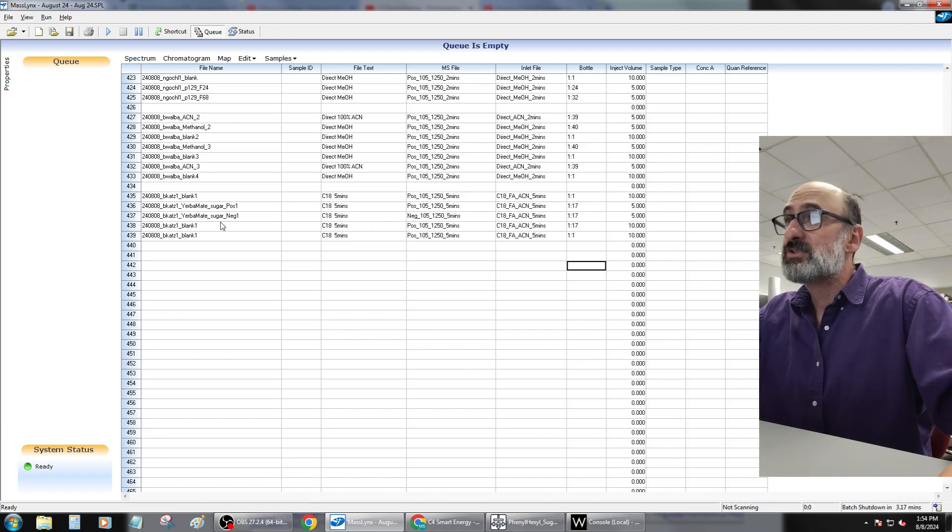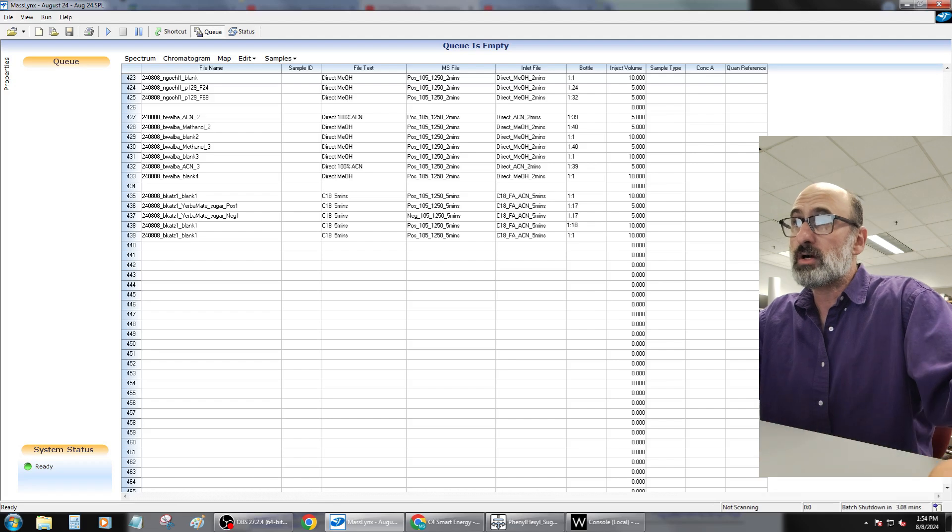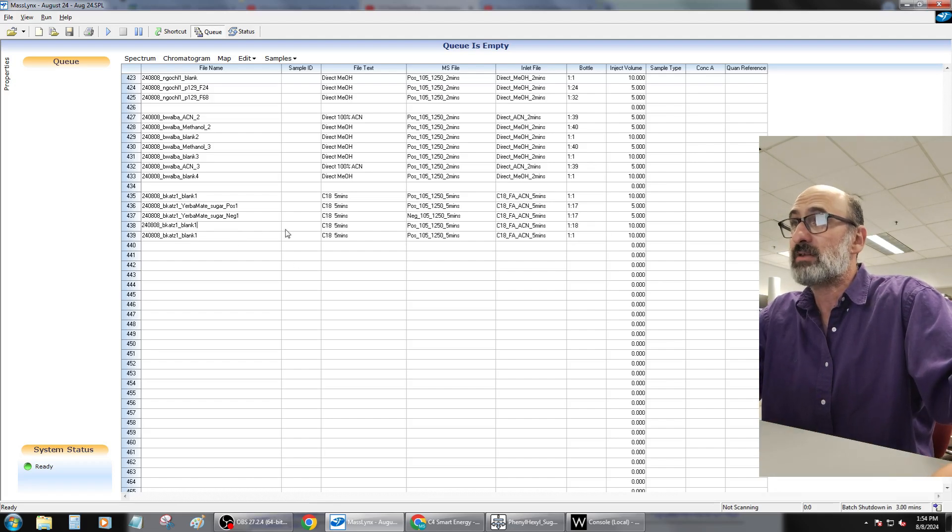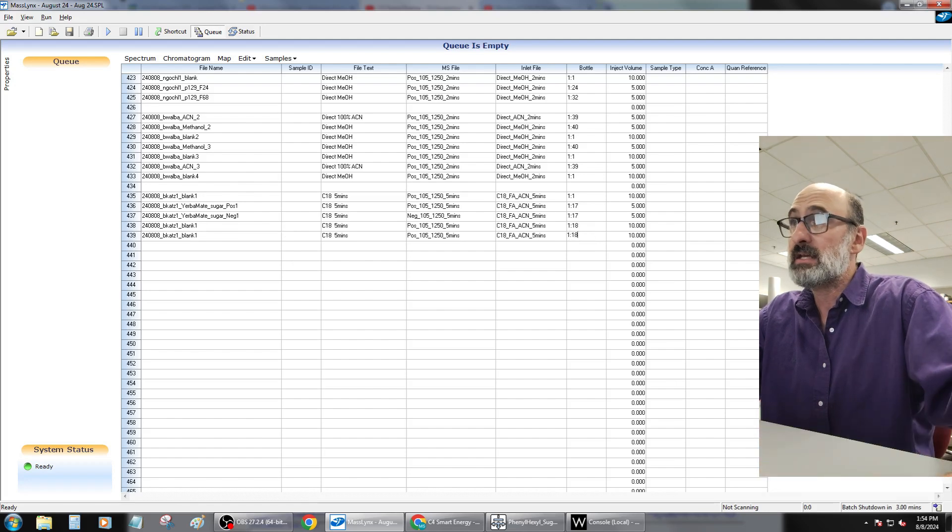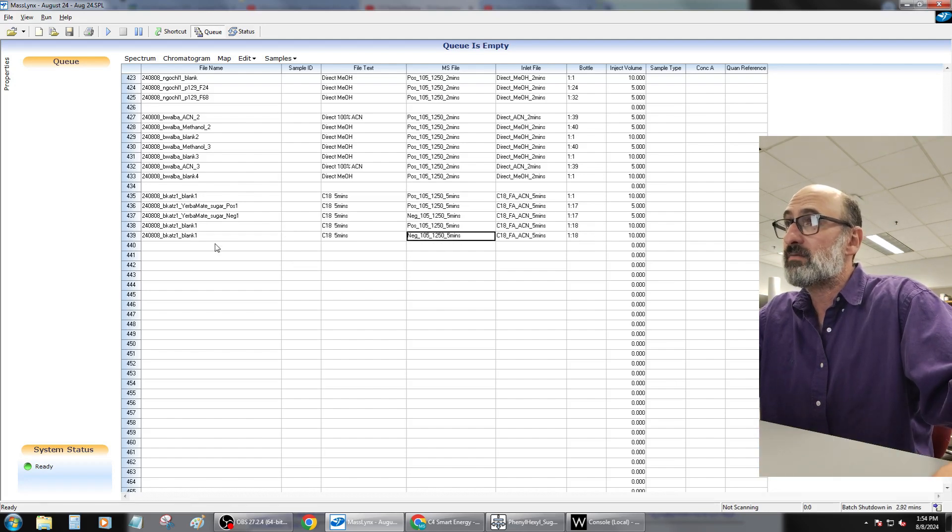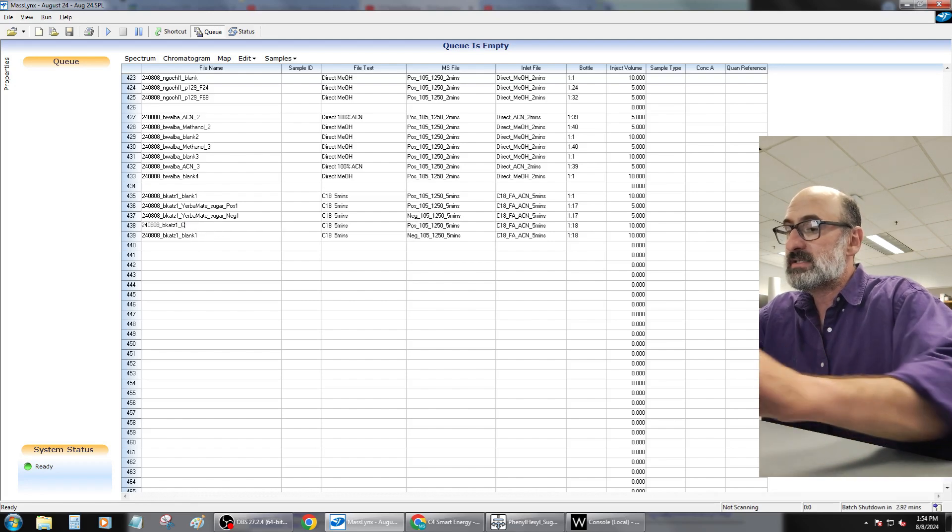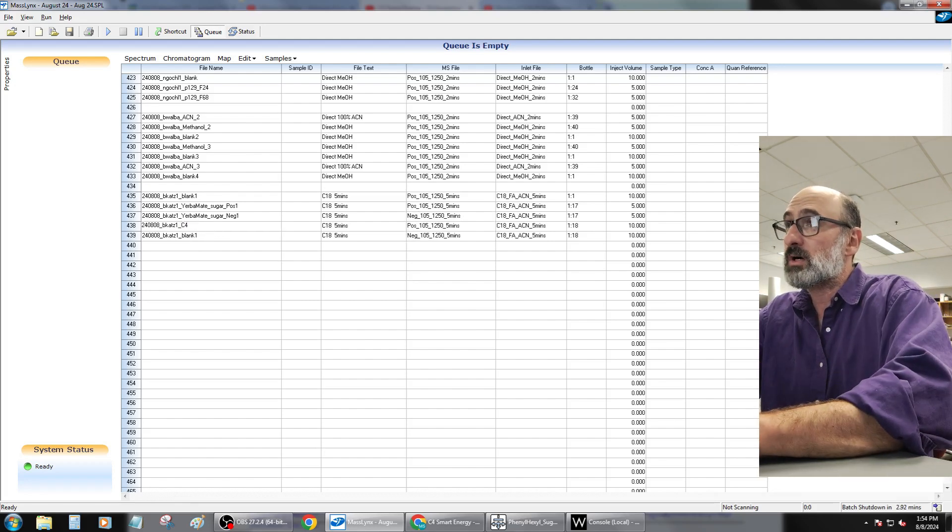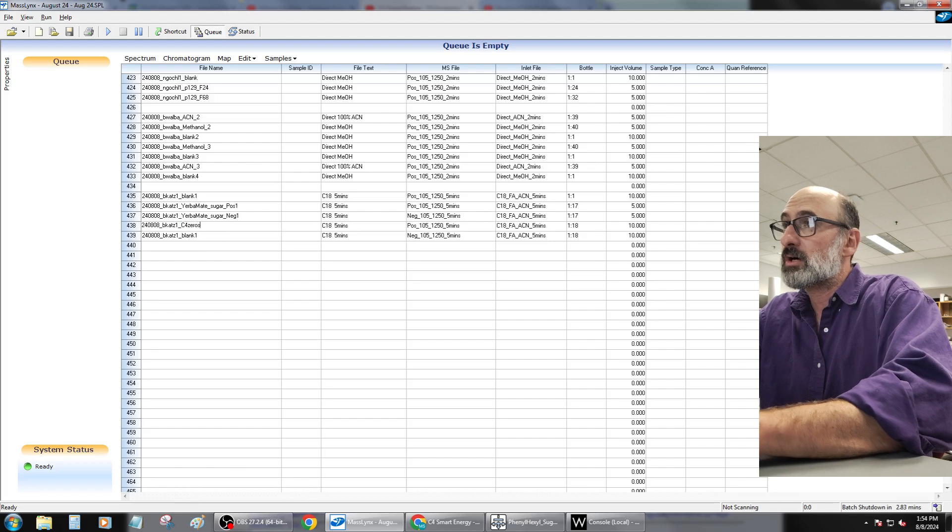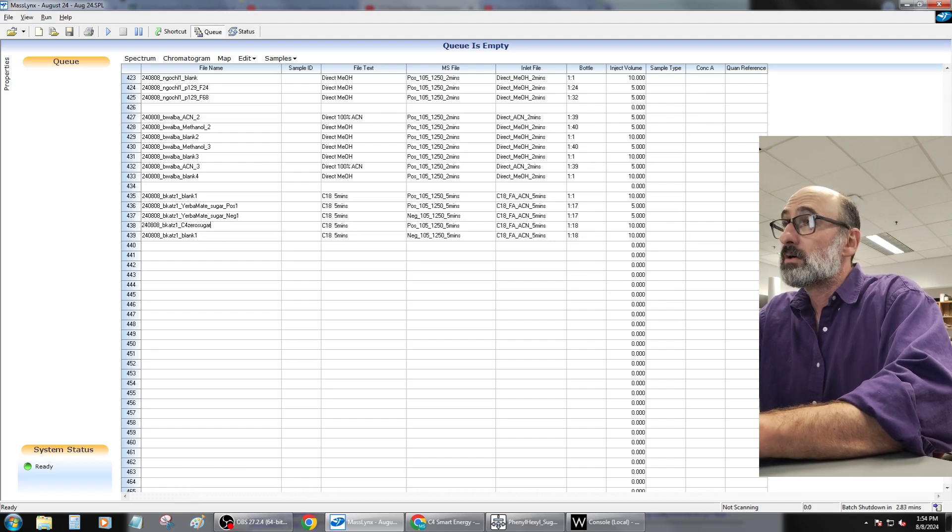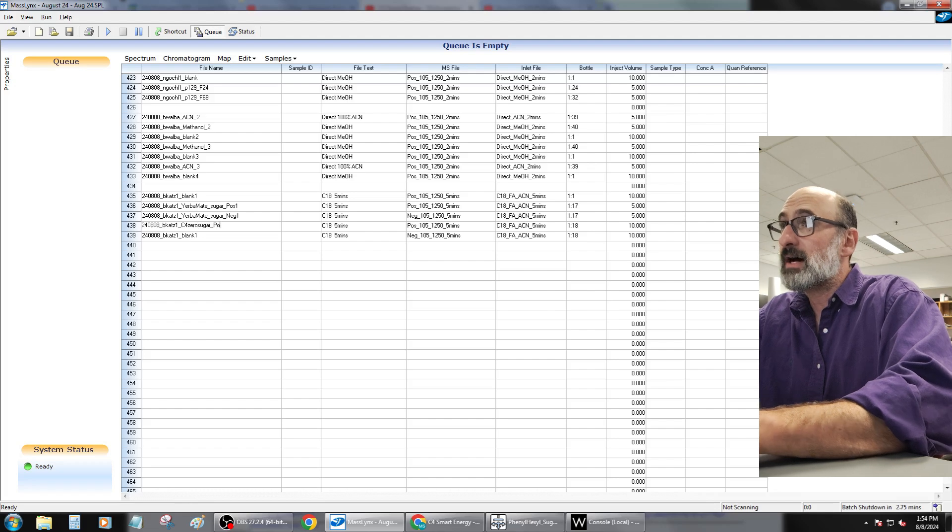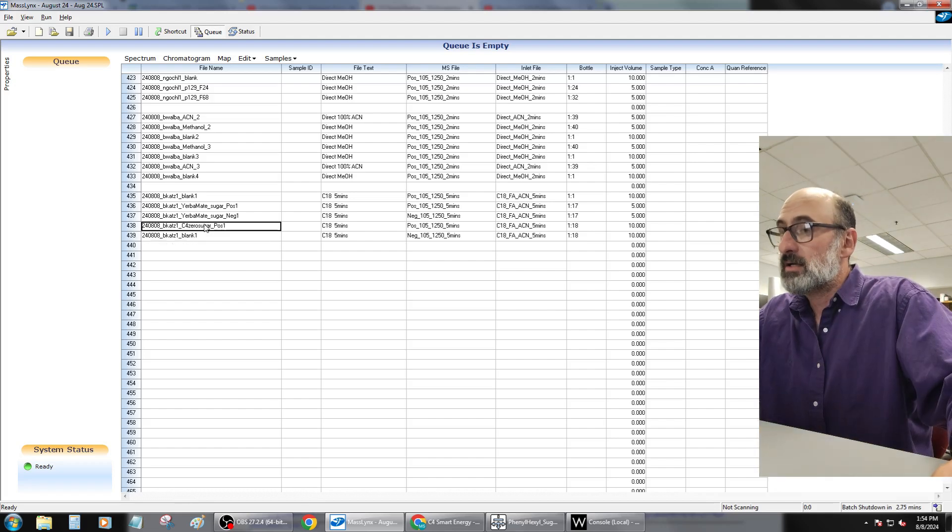Okay, and so those are these two. Then I'm also doing a zero sugar, which you just do a 10x dilution of the zero sugar energy drink—just run it directly. That's in position 18. Again, we're doing both positive mode and negative mode for this one, and this was C4 zero sugar, and this is going to be the positive mode data.